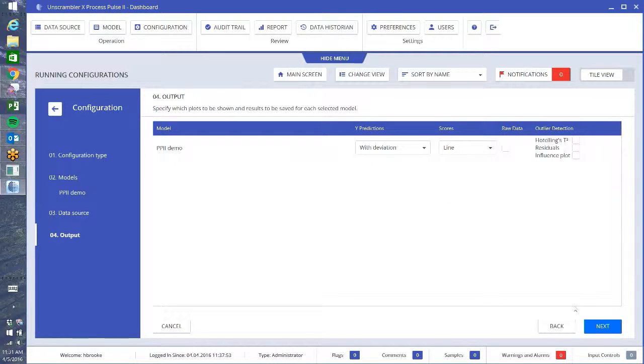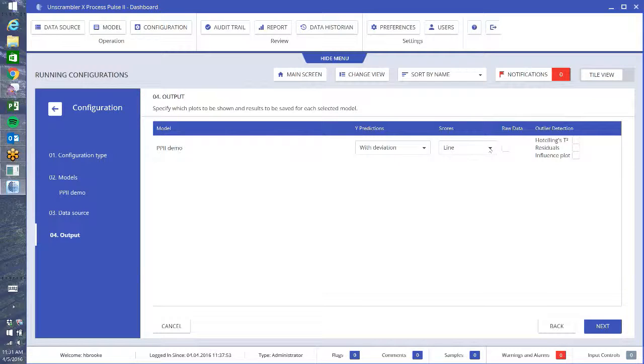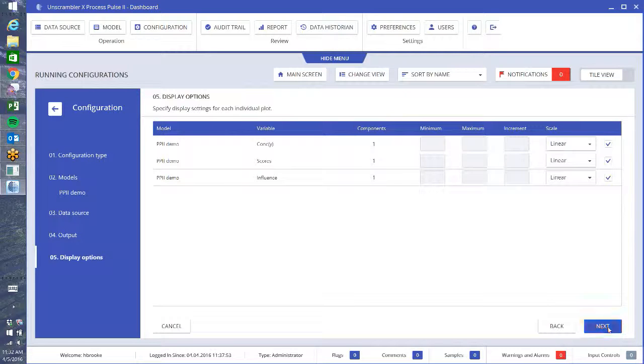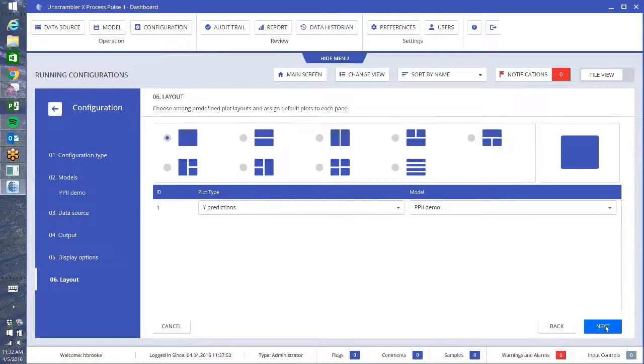From here on out, everything is similar except when we do a prediction, we want to say what do we want to view when it comes out. So I have my Y predictions. I want to do that with their deviation. I'm going to show my scores in this case as a line because I only have one factor, and I like to do my influence plot. That is our Hotelling T-squared against the residuals so that you can look for outliers. Next, we can just check if you want to force a minimum or maximum on your different plots. You can do that as well. I generally leave things at defaults.